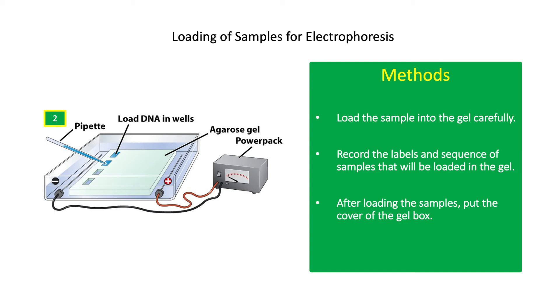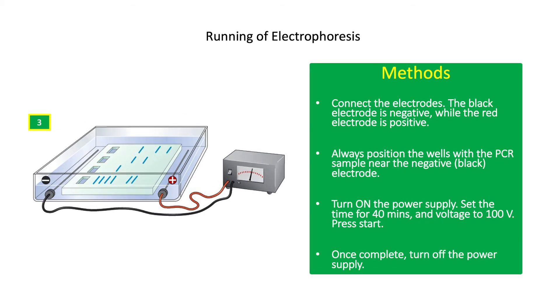After loading the samples, put the cover of the gel box and connect the electrodes. The black electrode is negative while the red electrode is positive. Always position the wells with the PCR sample near the negative electrode, as DNA is negatively charged and will migrate towards the positively charged electrode. Turn on the power supply, set the time for 40 minutes and voltage to 100 volts, then press start. You can observe the migration of the loading dye on the gel during electrophoresis.